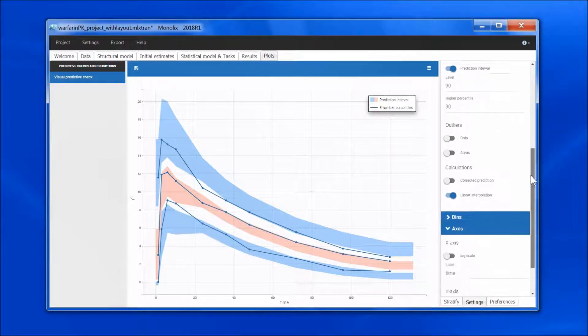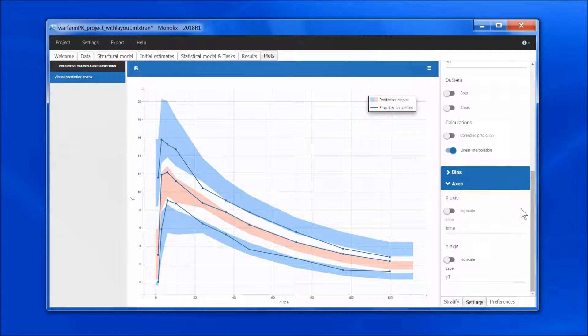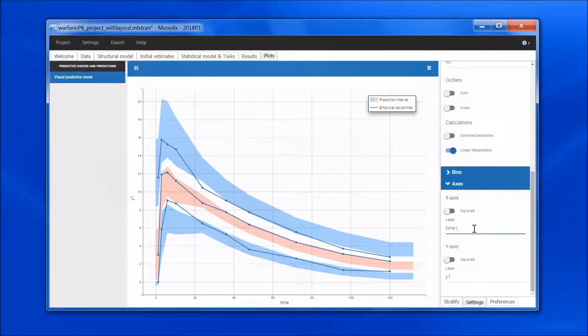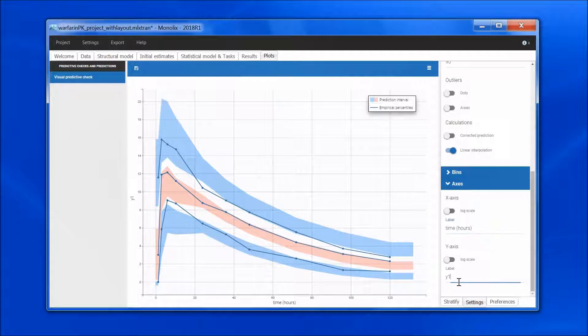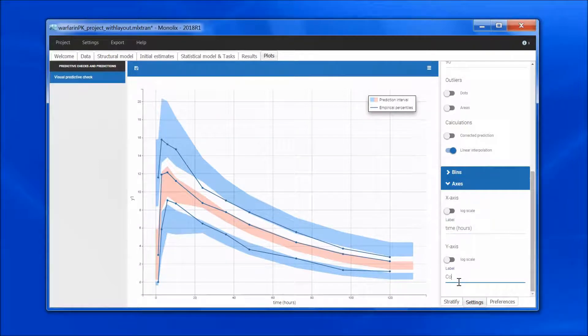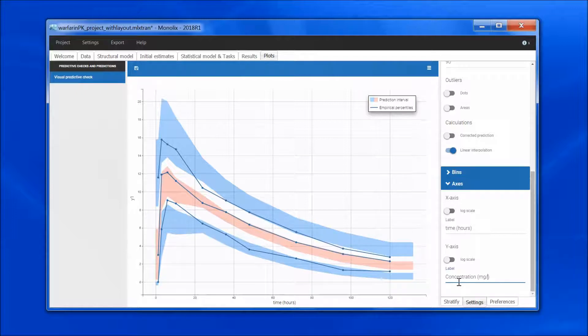Then I want to change the labels. I can do this in axes, and say that time is in hours, and the y-axis is the concentration in mg per liter for instance.